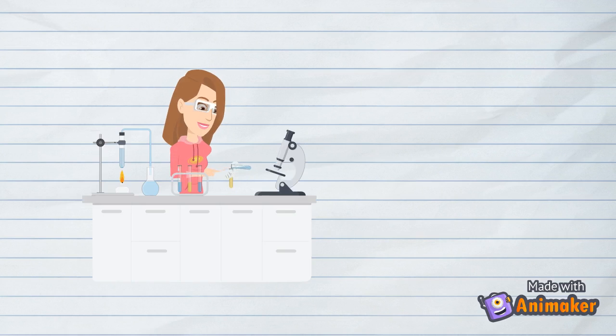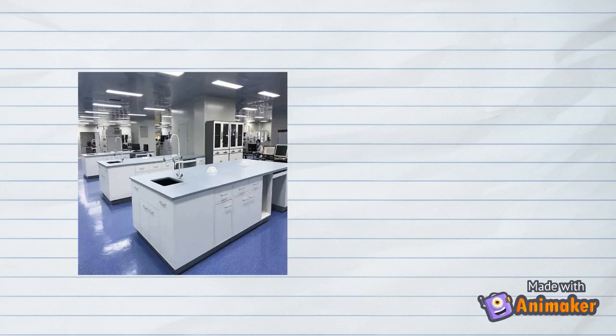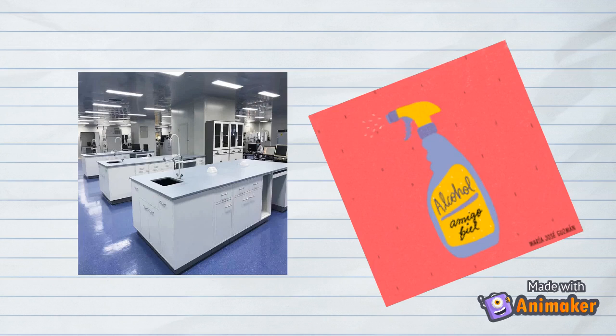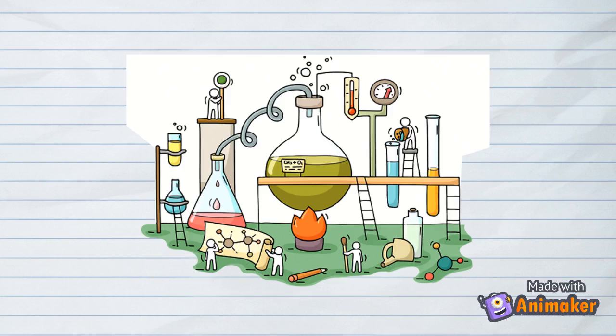The third element of aseptic environment is the work surface. Firstly, we need to start with a completely clear surface. Second, swab the surface with 70% alcohol. Bring onto the surface only those items you require for a particular procedure. Between procedures, remove everything that is no longer required and swab the surface down. Arrange your work area. Why do we need to do this?